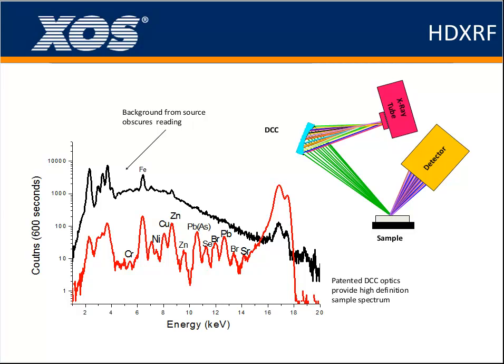And the second function of the DCC crystal is to focus X-rays, because the source of X-rays is emitting like a bulb, and we cannot use most of the energy, so we will lose a lot of energy for the first generation.